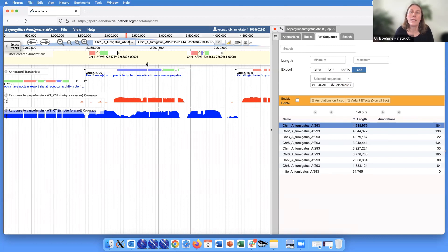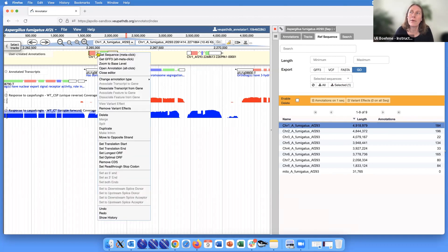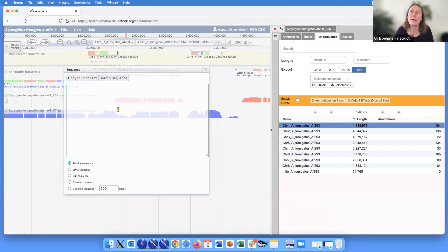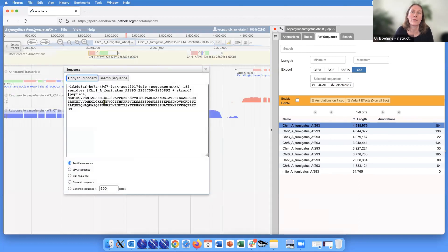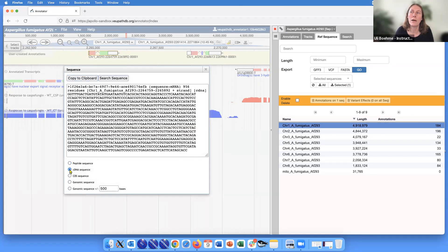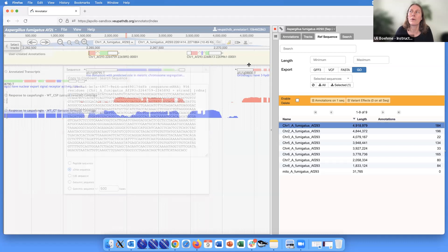If you're only interested in one gene, you can of course go in and just right-click, select 'get sequence,' and then you've got the sequence - either peptide or DNA sequence - to download.